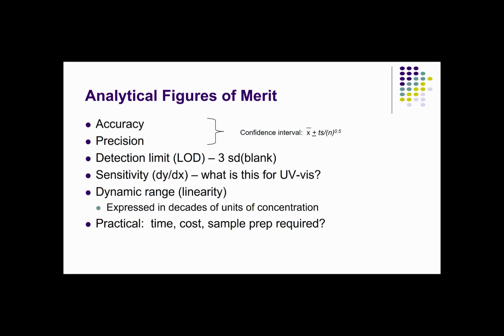So now we've talked about calibration curves as a method, and when you talk about using methods, people talk about choosing the right method, and part of what they're thinking about is a series of performance characteristics for analytical methods, and we call those analytical figures of merit. And they're extremely useful in helping analysts choose between a series of potentially useful methods, and they're also useful in helping analysts evaluate and optimize methods for use.